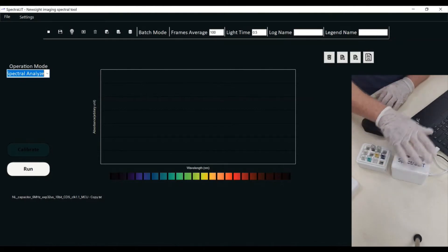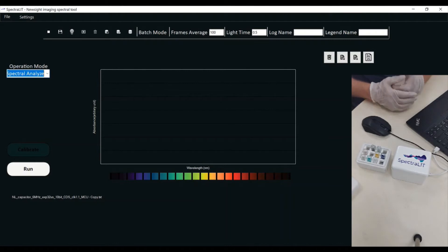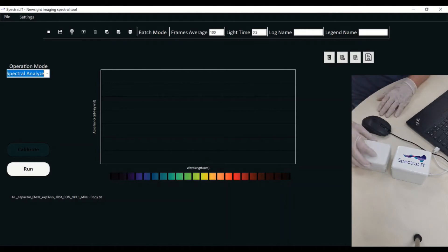In addition, we have the window-based system that actually controls the entire system.